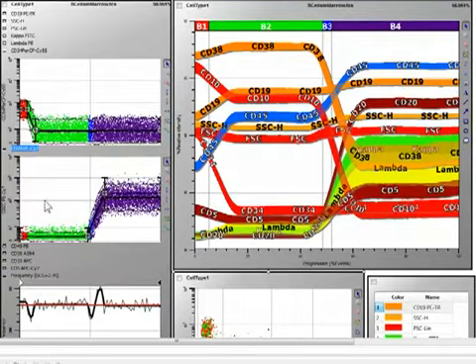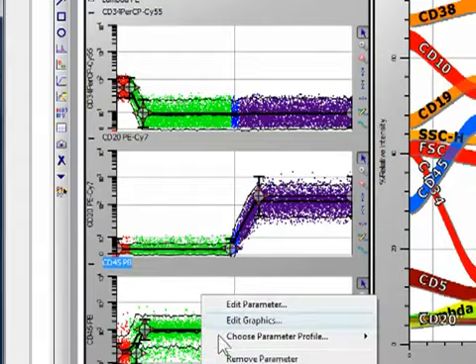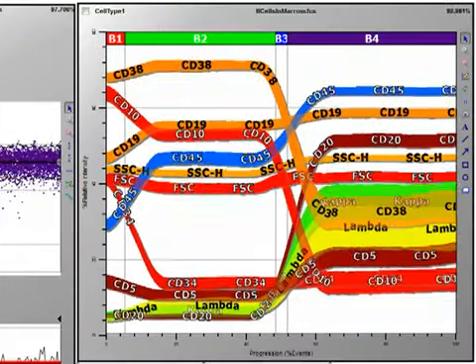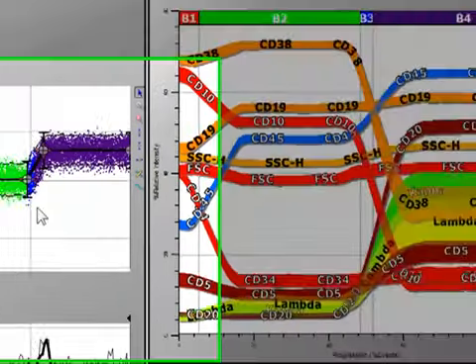What we normally do is do a few more in order to just refine the model. So for example, if we come down to CD45 at this point, we already can see that CD45 increases in 3 levels. But as soon as we add this to our model, I think you'll see that everything becomes a little cleaner and crisper as to where all the transitions are occurring. I see. I noticed some of the ribbons got narrower too. That's one of the characteristics of this software, is that as you add more and more parameters or measurements to it, it gets better and better.